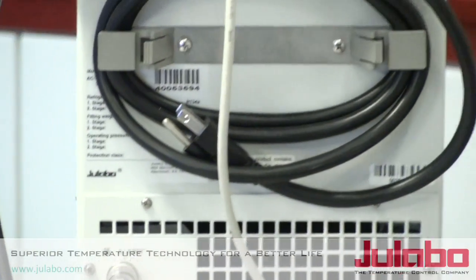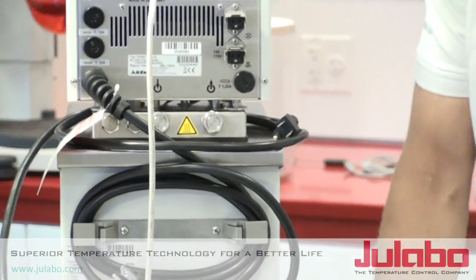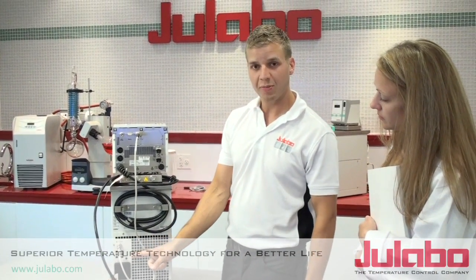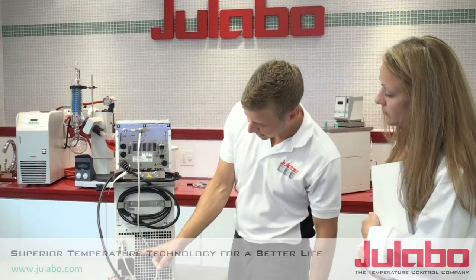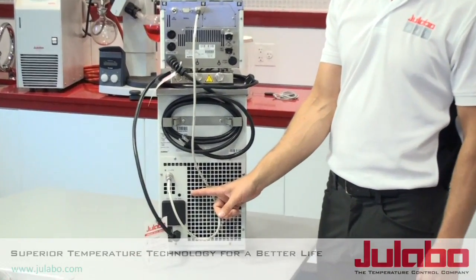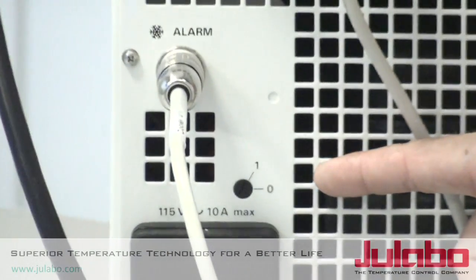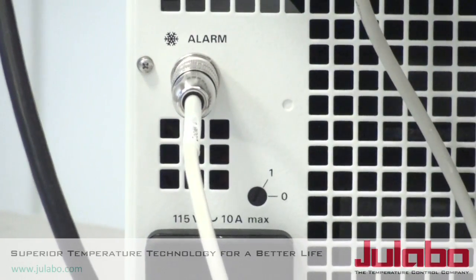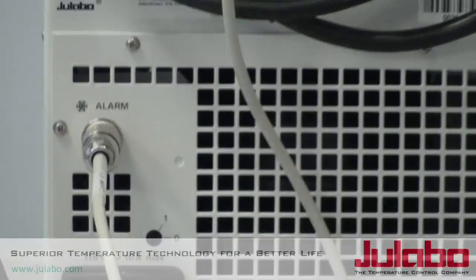Now note, if you have an Economy Series JULABO unit this procedure will be a little bit different. You will see here on the back of the unit that there is a marking for a zero-to-one switch, and that will initiate your cooling compressor communication with the circulator. If you have any issues be sure to call JULABO service.